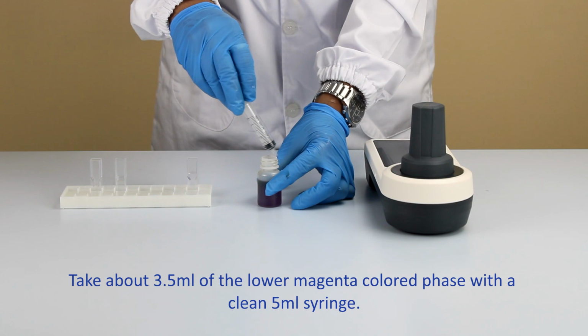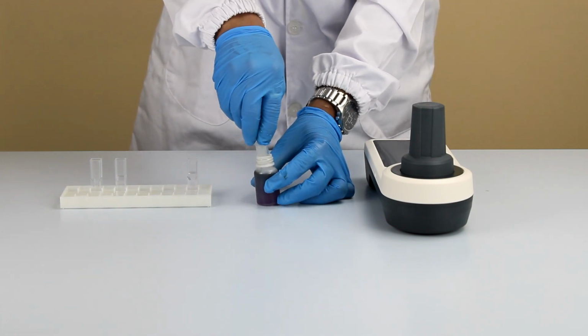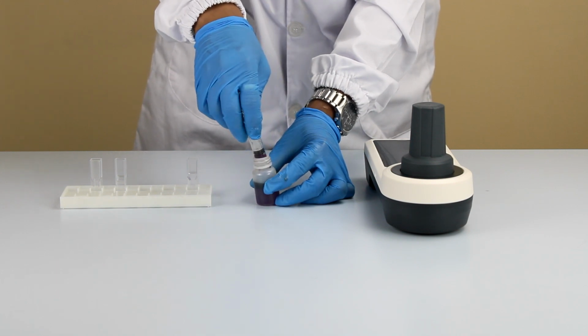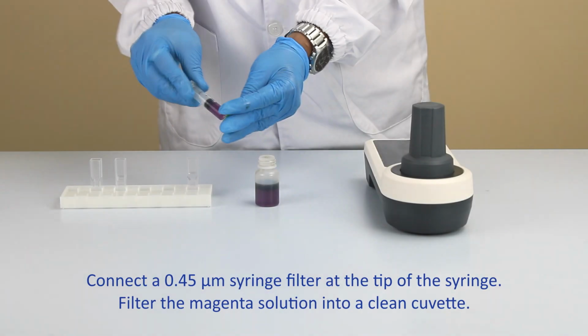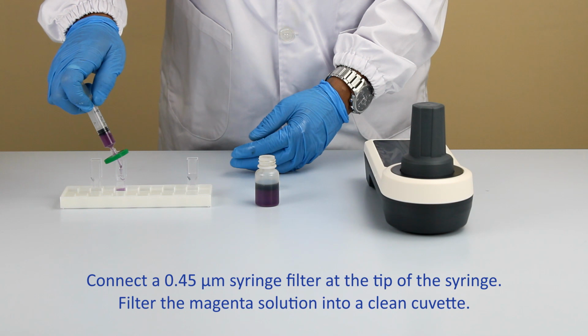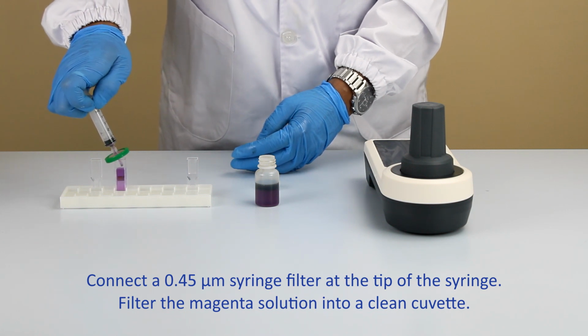Take about 3.5 milliliters of the lower magenta-colored phase with a clean 5 milliliters syringe. Connect a 0.45 micrometers syringe filter at the tip of the syringe. Filter the magenta solution into a clean cuvette.